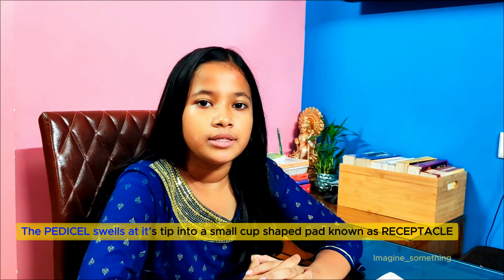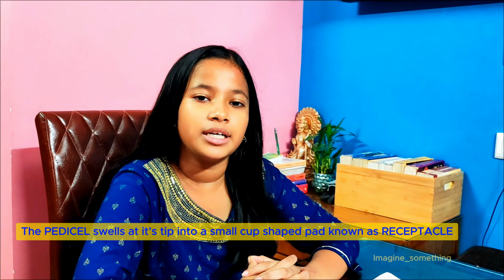The pedicel swells its tip into a small cup-shaped pad known as receptacle. All the floral whorls arise from the receptacle. A flower represents the reproductive part of a plant body. There are two types of flower, bisexual and unisexual flower.